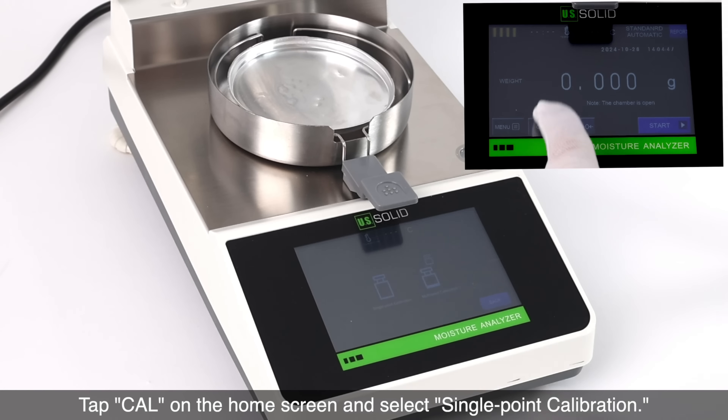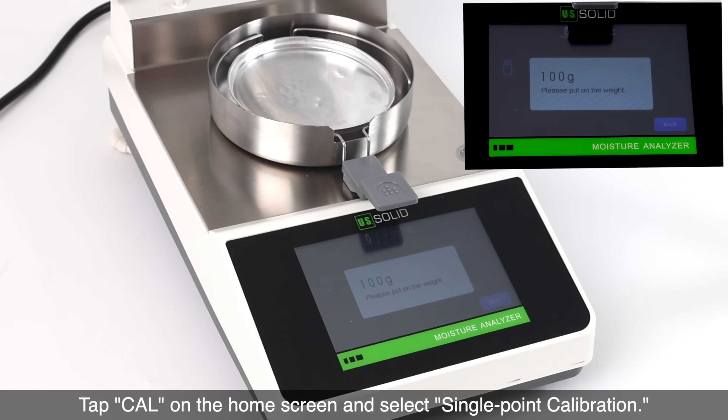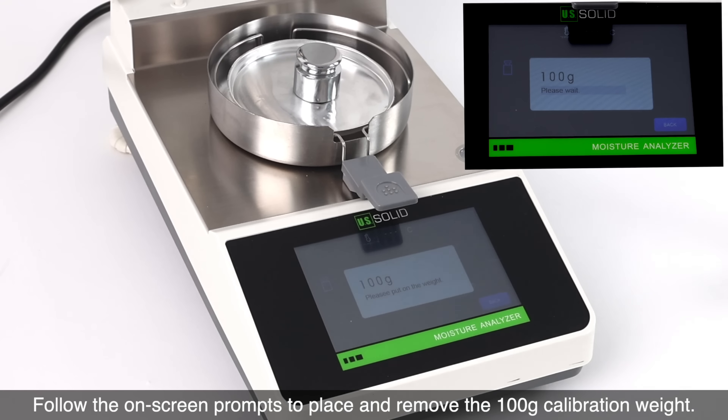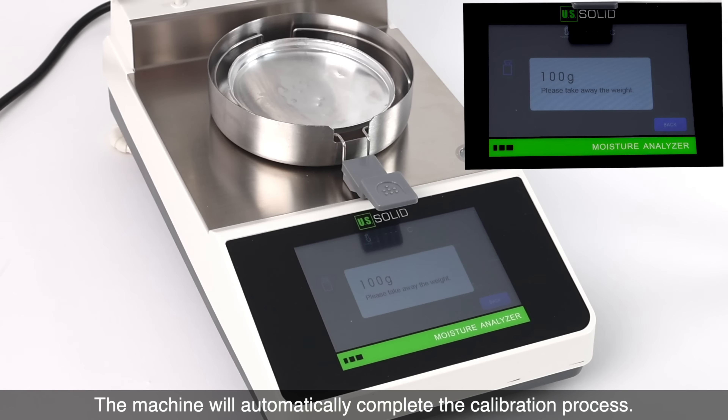Tap Cal on the home screen and select single-point calibration. Follow the on-screen prompts to place and remove the 100 gram calibration weight. The machine will automatically complete the calibration process.